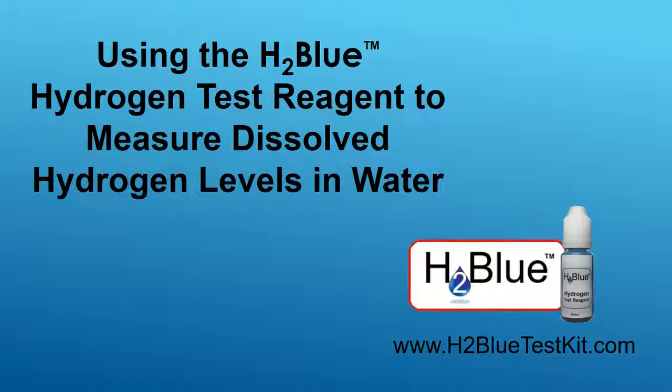Welcome to this tutorial on using the H2Blue hydrogen test reagent to measure dissolved hydrogen levels in your hydrogen water. I'm going to be doing this presentation in two parts. The first part will be a short PowerPoint presentation giving you some fundamental principles and concepts behind the H2Blue test reagent. And then in part two, I will actually do a video showing how to use the reagent to test for your dissolved hydrogen levels.